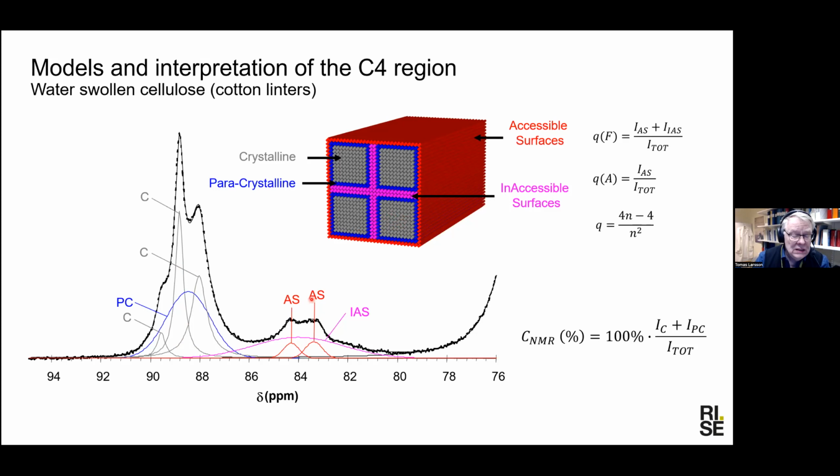And we can see that surface polymers are distinct. There are about 4 or 5 ppm in carbon-13 shift difference due to difference in conformation. So for that reason, we say that the surface polymers are not crystalline, and we are considering those to be non-crystalline, not amorphous. They have a rather high degree of order along the fiber, but they are not crystalline.